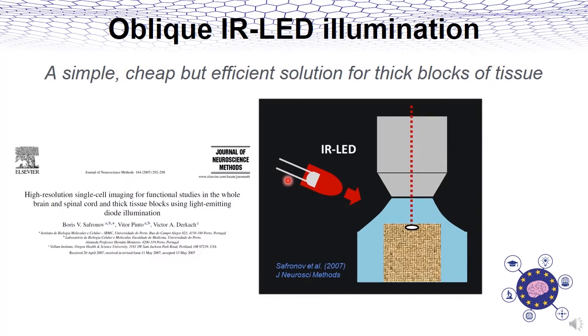A solution that circumvents this problem was published by Boris Safronov in 2007. The technique described in this paper uses an infrared LED positioned close to the illuminated surface, exploiting reflected light instead of the transmitted light that is used in the case of DIC.